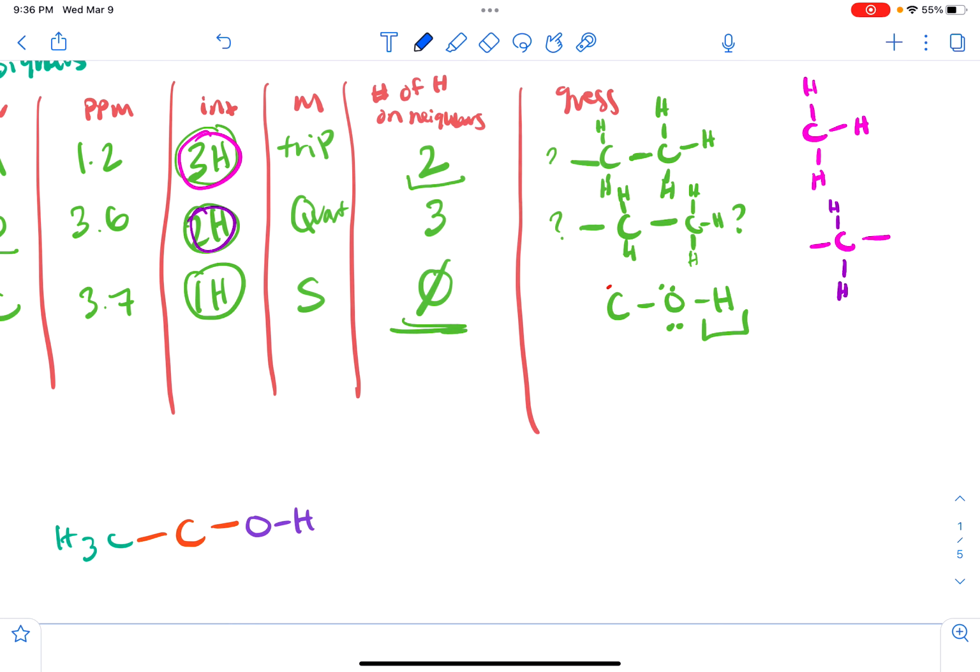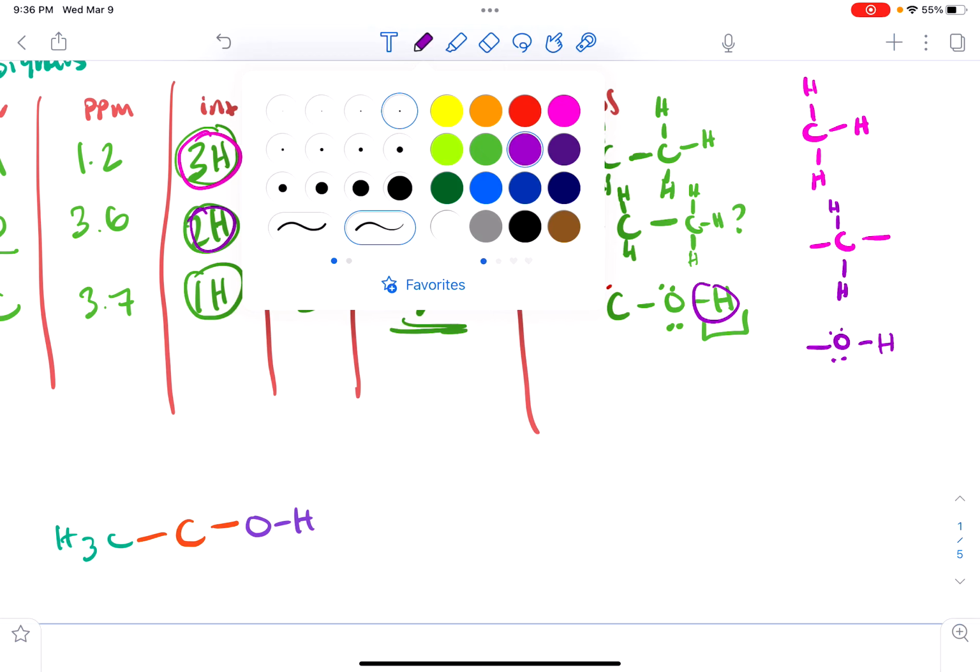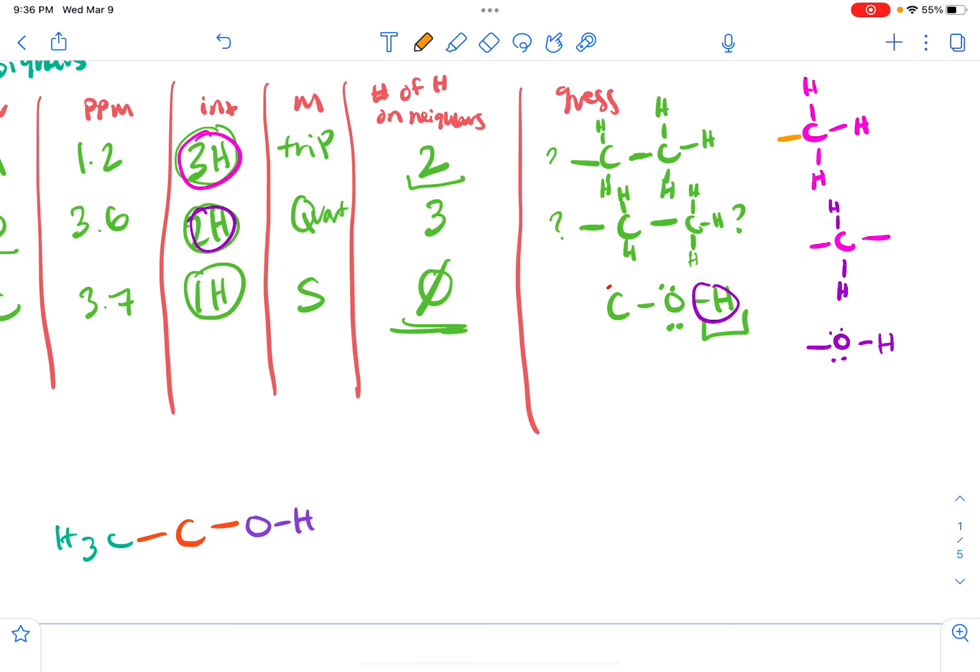And then lastly, this last hydrogen here is going to make 1 bond, which we can infer attaches to that oxygen. I'll pick a different color. We've got 1 bond-making capability, 2 bond-making capabilities, and 3 bond-making capabilities.